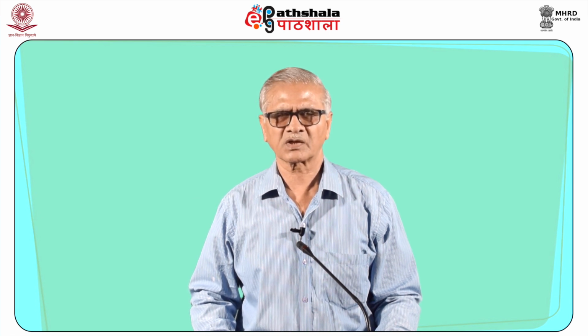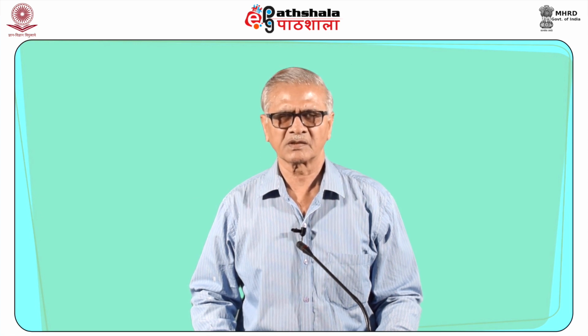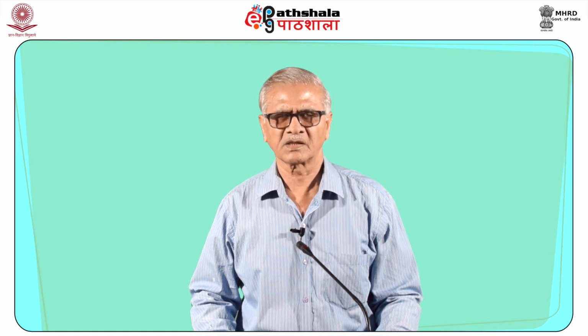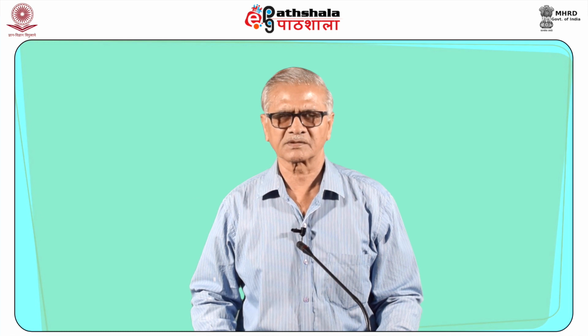The principle of shotgun sequencing is based on the fact that Sanger's method of DNA sequencing can only be used for short sequences from 100 to 1000 base pair, and long DNA sequences must be subdivided into smaller fragments, sequenced and later reassembled to yield the overall sequence.